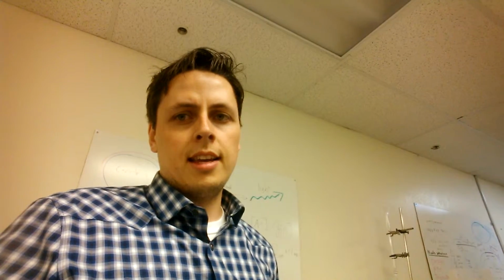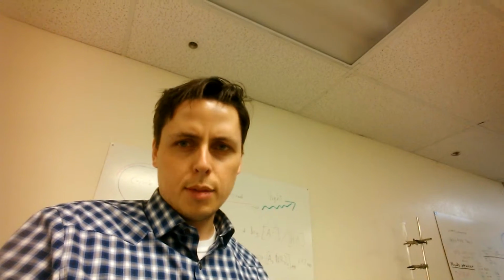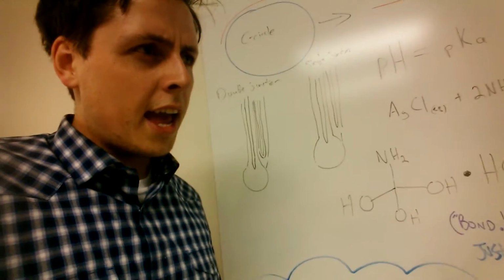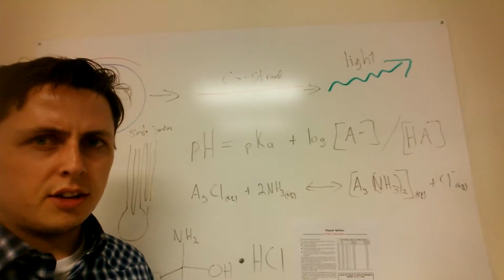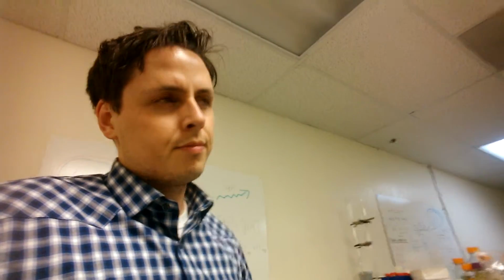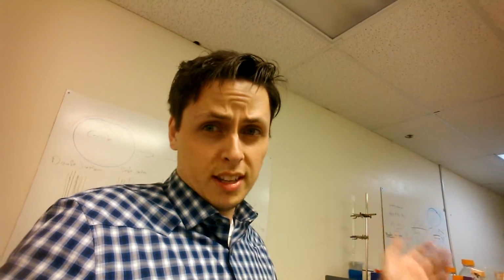Now, this assay needs a pH of 7.6, pH being how acidic a solution is. And I get the pH to 7.6 with a buffer called Tris, which is right there. A very time-intensive way of preparing a Tris buffer is by using the Henderson-Hasselbalch equation. You can use Tris base and hydrochloric acid. You've got to do a bunch of math, and it takes a while to do. But you don't have time. There are so many experiments going on at once, so many things to do. It's very important to do things as quickly as possible.